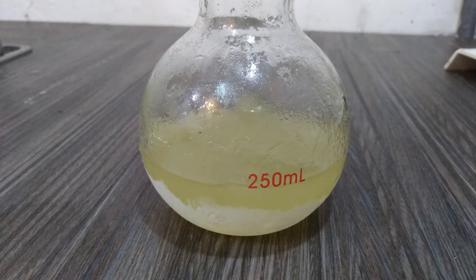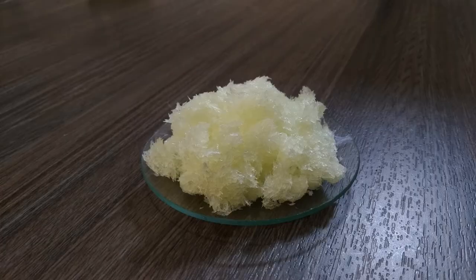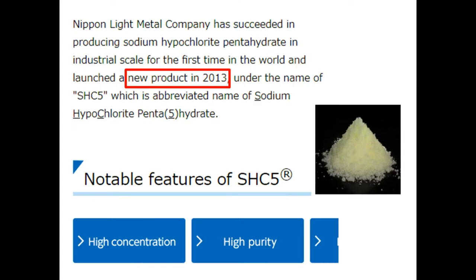The liquid part is what we want, and I put it in the fridge. A couple of days later, lots of crystals form in the flask. After vacuum filtration, we have some nice greenish-yellow crystals — sodium hypochlorite pentahydrate. The melting point is about 25°C. Liquid bleach smells terrible, but the pure crystal is almost odorless.